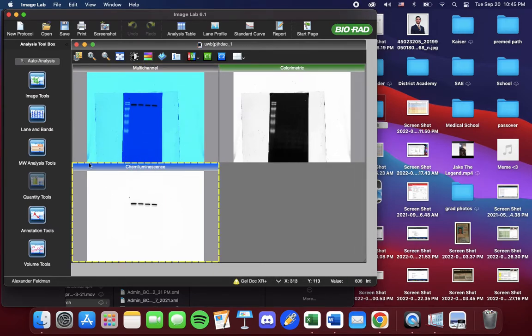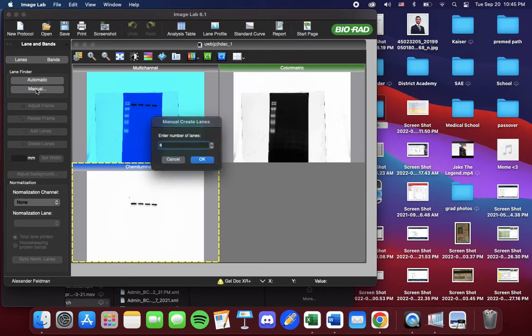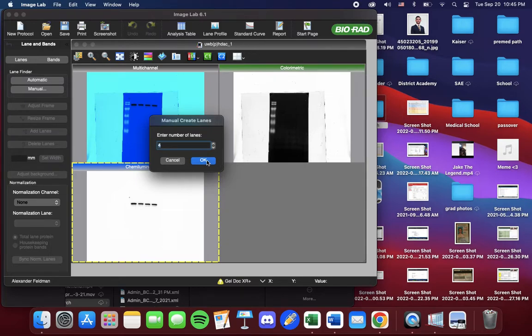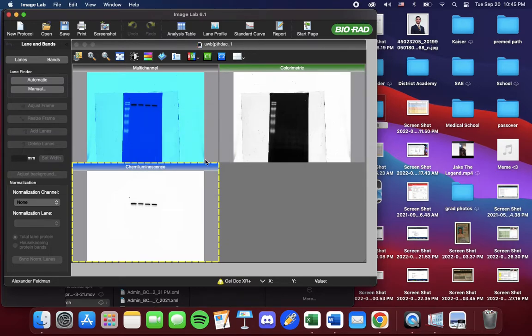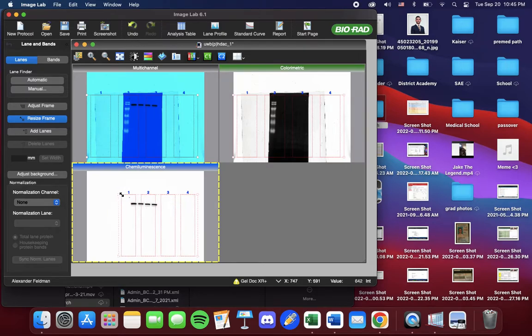We go over to the left to Lane and Bands. Under Lanes we see Lane Finder. We can go to Manual. Now you can select how many lanes you want. We could increase or decrease, but we're going to stick with four today. Press OK and four lanes will automatically pop up.